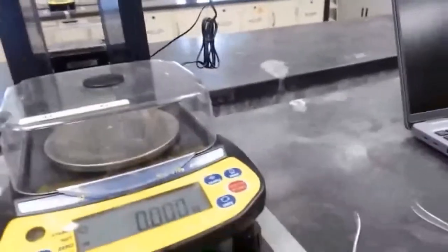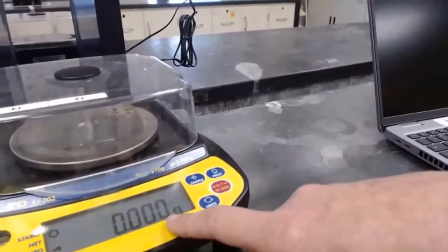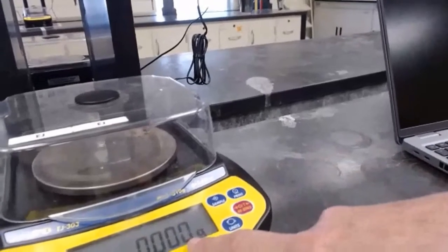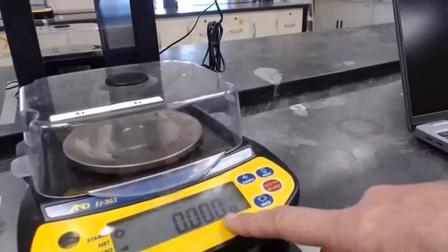So if we take a look at our balance, you will see that there are numbers that go all the way to the 1000th place. There will always be a number displayed in the 1000th place, and that will be the last digit. The last digit is the estimated digit.